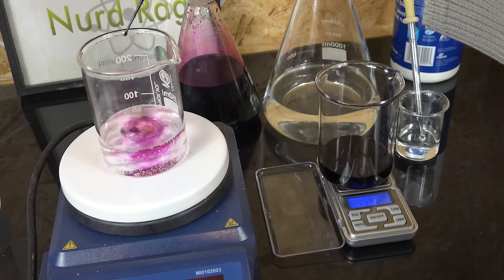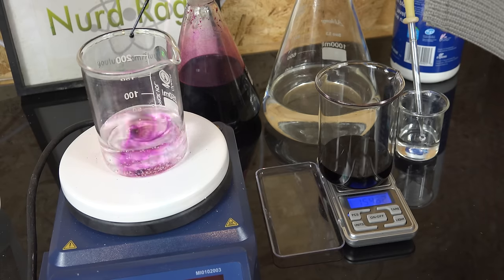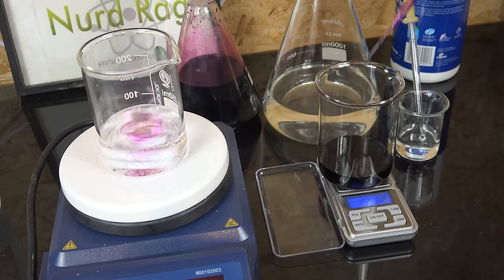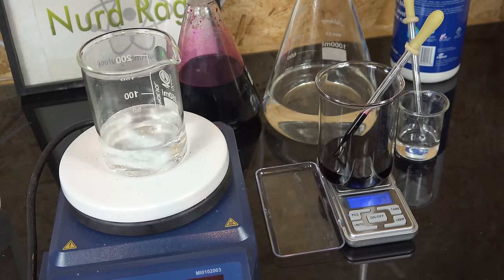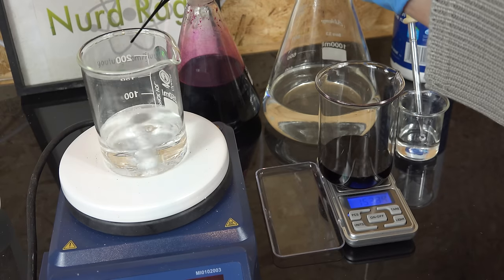We have our sample under study, the analyte, and we react it with a reactant or titrant. Now it's very important that we have some type of indication when the reaction completes, otherwise we might add too much and never know. Usually chemists will add a small amount of indicator compound that changes color when the reaction completes.